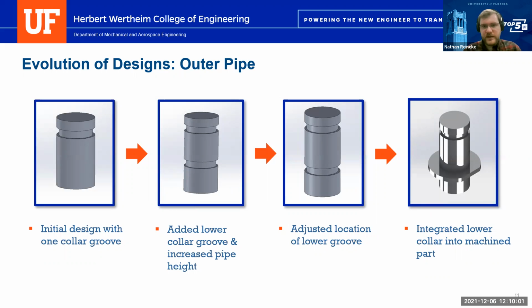Once we did that, we went to the outer pipe. This controls the fluid volume that we can accurately measure, as well as how much it's going to be ejected at what rate, keeping the rate of the motor constant. Basically, we change the cross-sectional area of the interior of the outer pipe. By changing that, we can change the fluid volume, because as you increase the area, you increase the volume that's getting sucked up, as well as the depth.